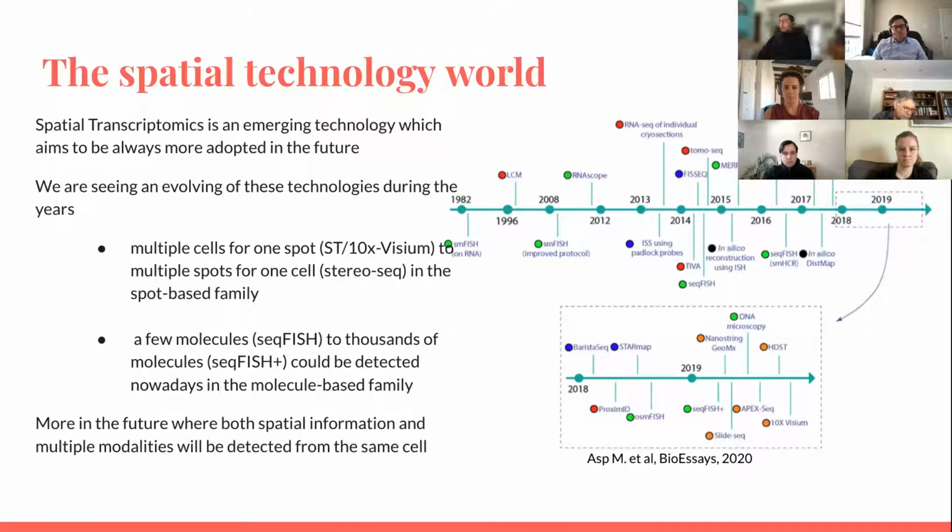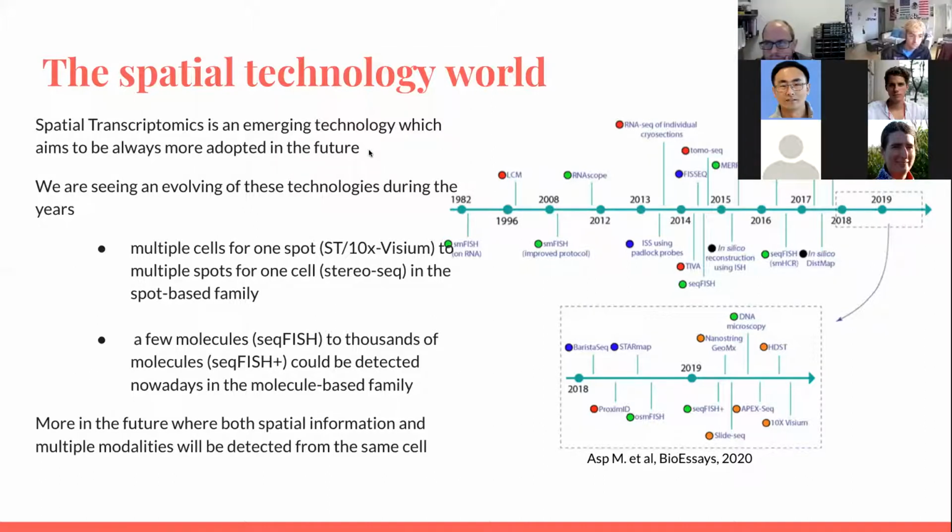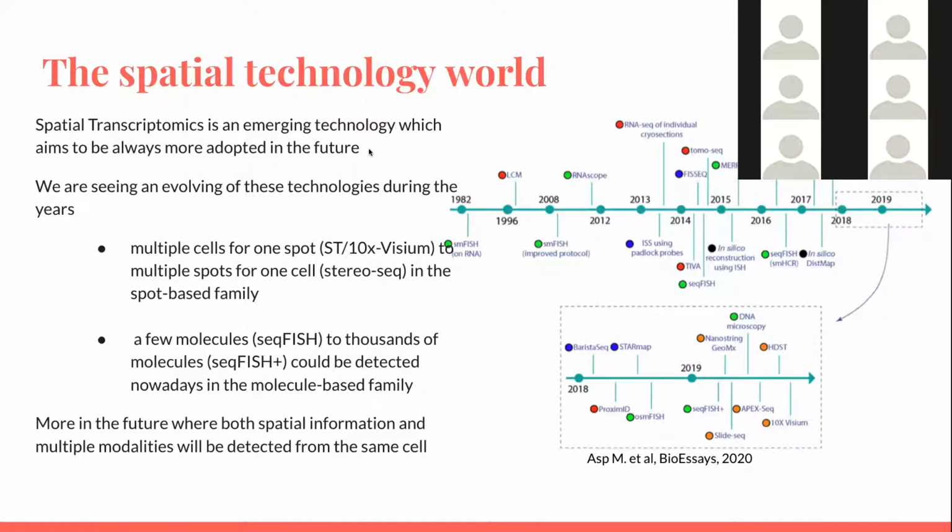So just a couple more slides. Here it is to summarize a little bit the world of the spatial transcriptomics technologies, because the spatial transcriptomics technologies will be even more adopted in the future. And if you want a review on these technologies, there is this review, which is a very brief review.